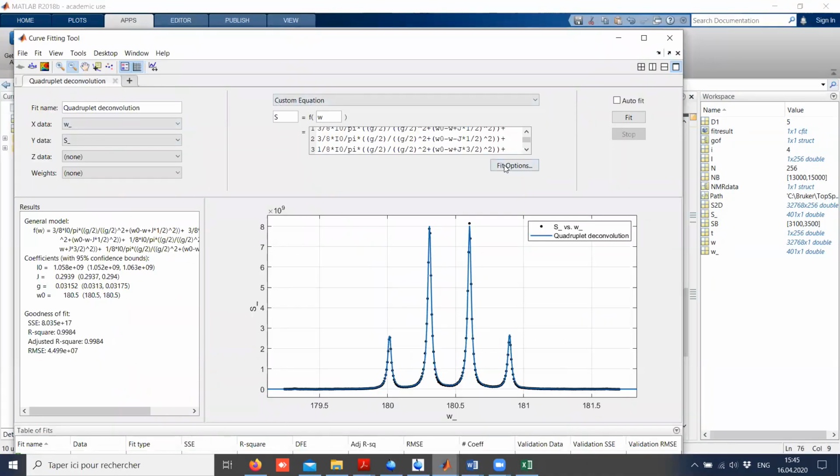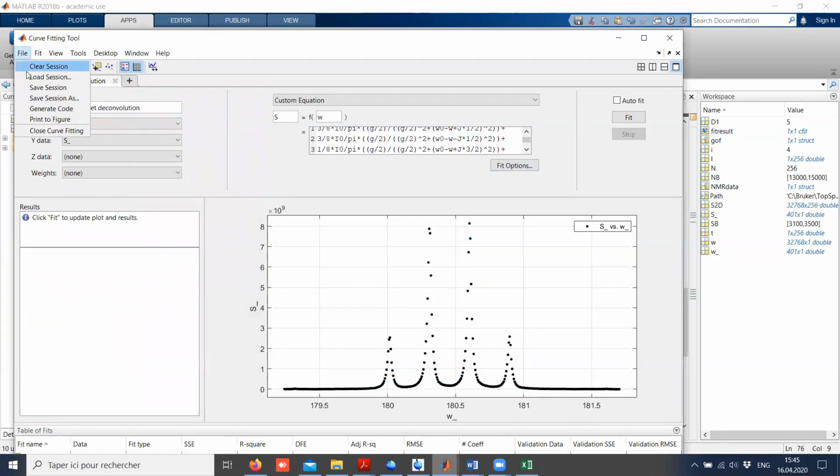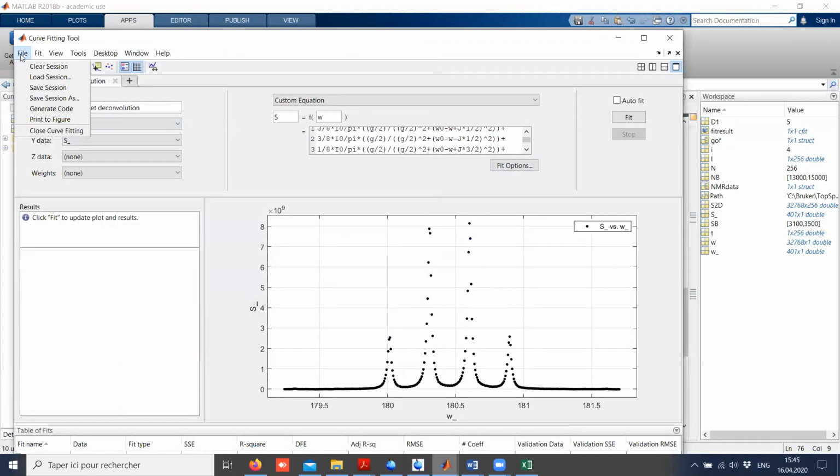Okay, I see, because this is a time course. This is spectra as a function of time. Yes, in a way, it is. Okay, I see what my confusion is. Thanks. What I often do here, you have maximum iteration. Usually, I multiply it by 10, so that I give it more time to converge, because anyway, the function is super fast. Okay, I think that's answered my question. Good. But I'm still going to do that.